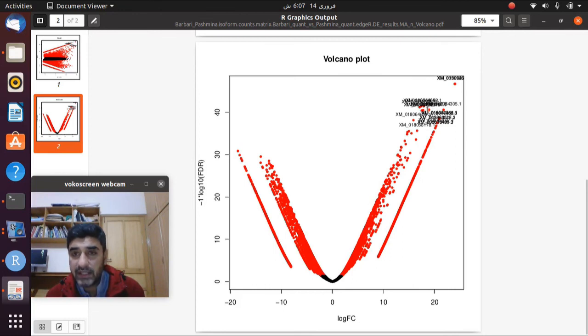So we can say that these are statistically significantly upregulated in Barbary, and these are downregulated in Barbary.